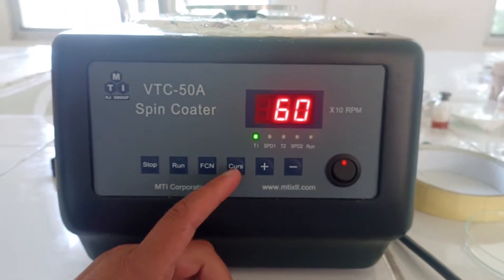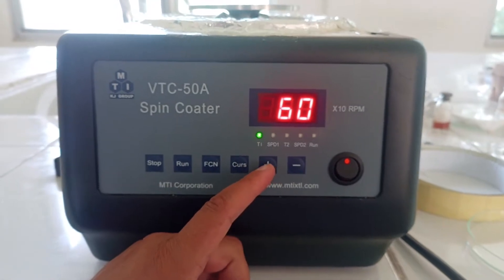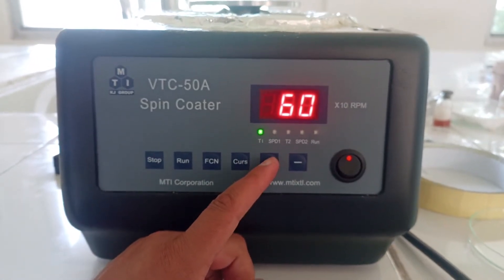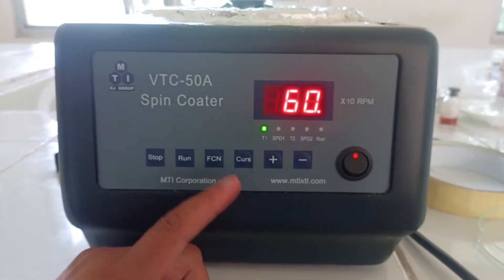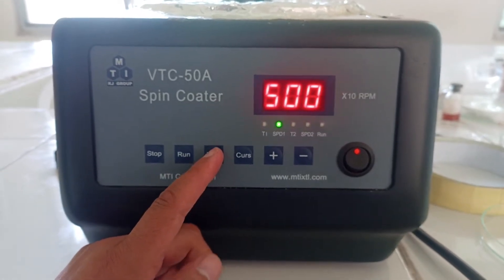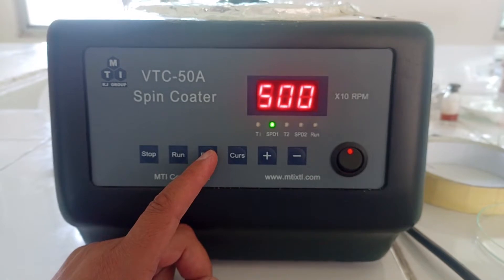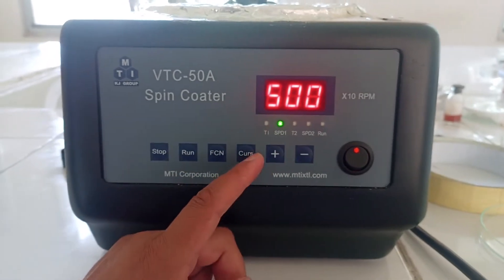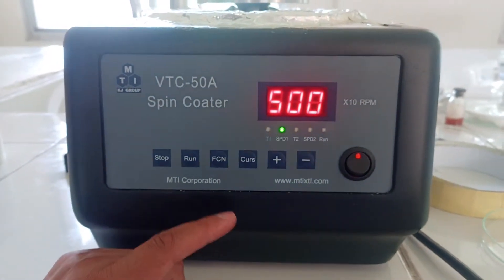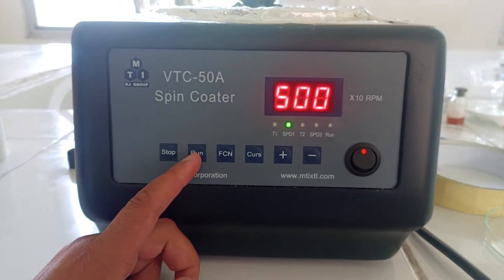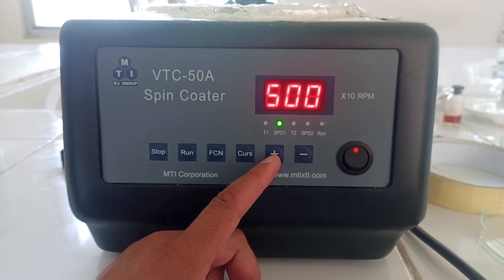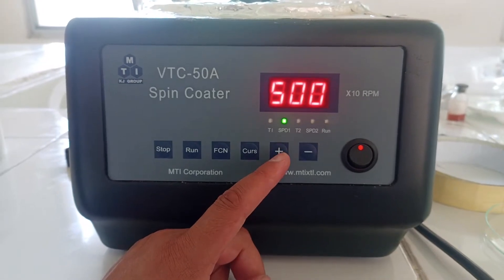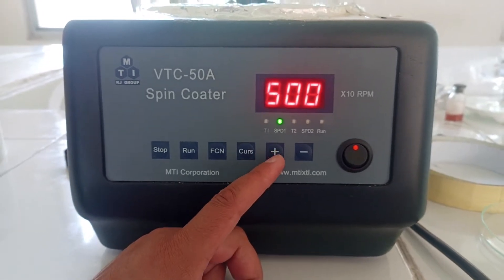First we will take the time, so we can adjust time from here, and then we will shift to the revolution speed. Revolution speed here is mentioned 500 RPM times 10, so it is 5000 RPM. We can use these cursors to up and down the RPM and the time.